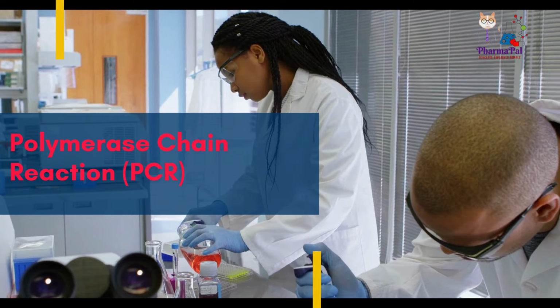To perform PCR, you'll need a DNA sequence for amplification, a pair of suitable primers that flank the target sequence, a suitable DNA polymerase, and a supply of the 4 dNTPs. Initially, PCR was done using water baths at different temperatures. However, now we have programmable thermocyclers that automate the process, making it more efficient and precise.